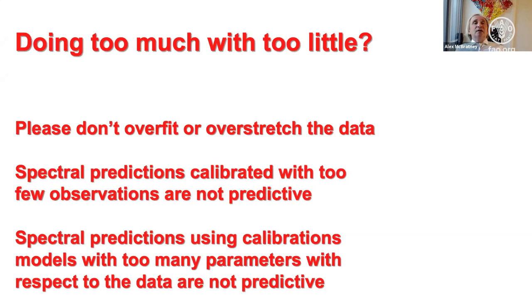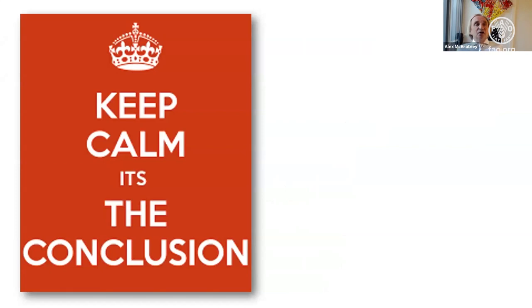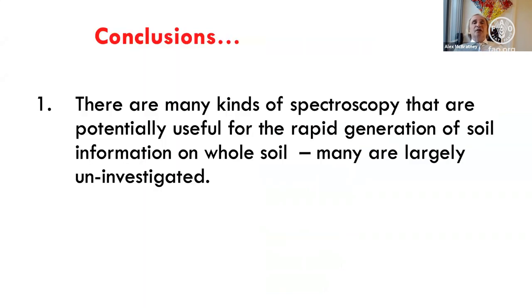Let me go to the next slide. So let me do some conclusions, which hopefully are a bit more positive. There are many kinds of spectroscopy that are potentially useful for the rapid generation of soil information on whole soil. But at the moment, many of those are largely uninvestigated. So those of you who are looking for a project for the future, there are many projects for the future in the talk that I've given you today that you can investigate. Many kinds of spectroscopy that you can investigate and write many nice papers about. Next slide.